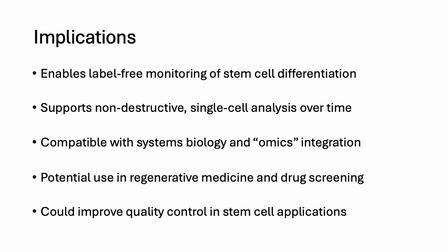Finally, the technique might prove useful in drug discovery, especially in screening how candidate molecules influence cell differentiation pathways, since repeated scans of the same culture can reveal shifts in spectral signatures early on, well before morphological changes become visible.